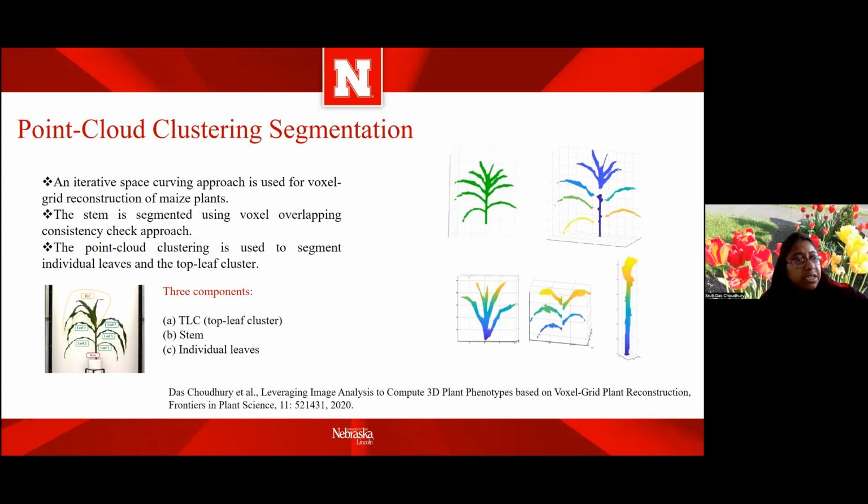So if the number of cross-sections is 2, we conclude the presence of a junction with a leaf. Note that this assumption holds true for maize plants, as I just said, because in maize plants, leaves emerge using a bottom-up approach in alternate opposite fashion, and a single leaf is attached to a junction.